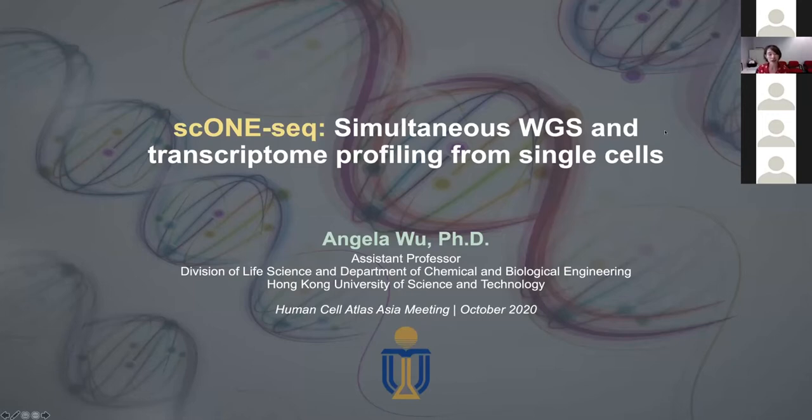I gave a talk in Singapore last year at this meeting, and I briefly mentioned this work that we were doing at the time called scONE-seq, which is a technology for simultaneous profiling of DNA and RNA from single cells, so that we can obtain both the whole genome and also the transcriptome from the same single cell. And I'm very happy to present a little bit more on this work this year. With this method, hopefully we can share with everyone soon so that you can also use it.